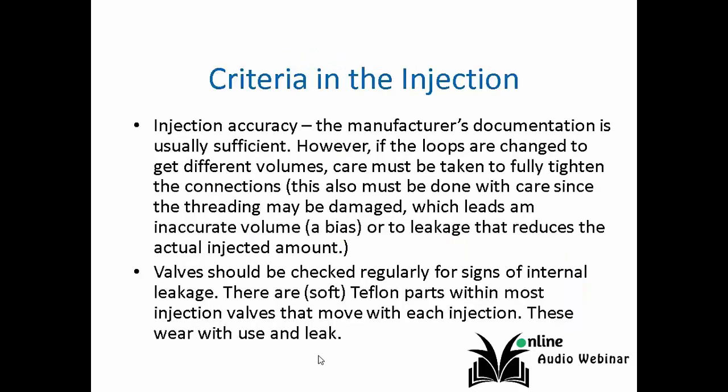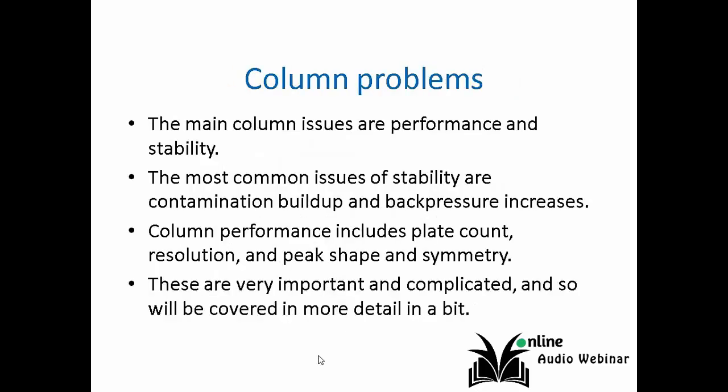Some problems that people miss when they're doing it: injection accuracy that people often use is what is stated by the manufacturer. Column problems are varied and numerous.